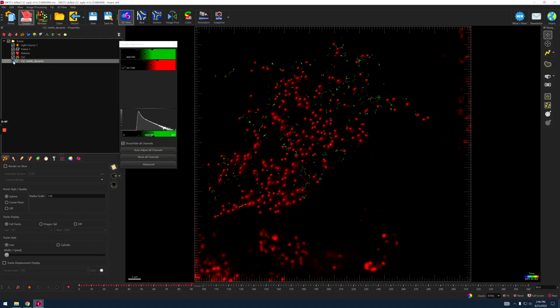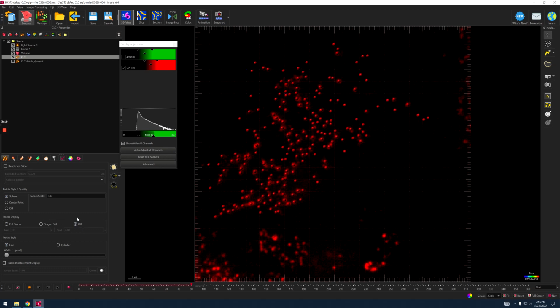You would go back to the clathrin light chain that we created in our video number 2. It's the most original clathrin light chain spots and tracks. As you can see now, there are a lot of timestamp tracks, and closing this will make the image clear and easy to see.